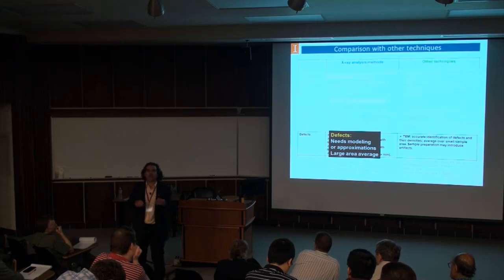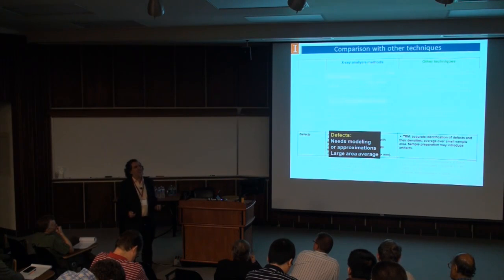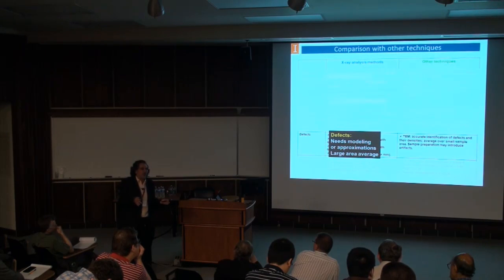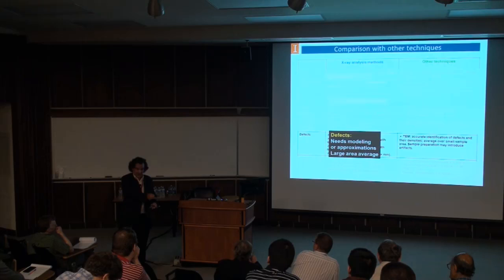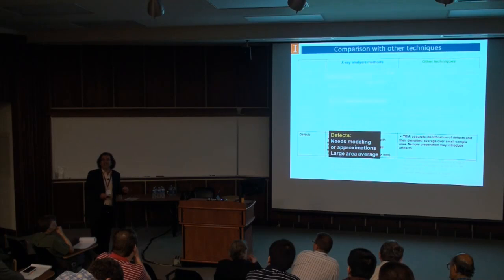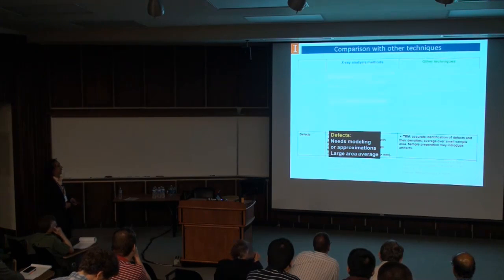There are lots of models for different things, but how can you actually get defect quantification from X-ray data? It's basically looking at the width of the peak and assuming some functions, the tail of the peak, diffuse scattering. It's not a clear-cut thing like in the TEM. You just see the points there, the bugs inside the sample. We don't see that, so that's the part where you need lots of modeling. That we could do better.